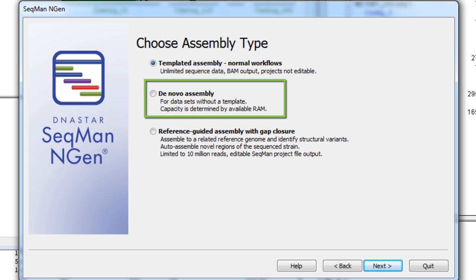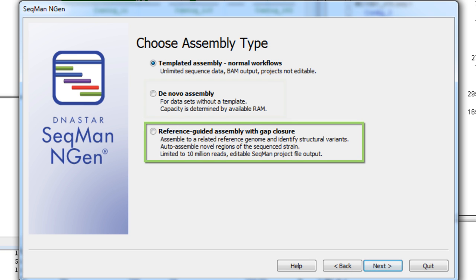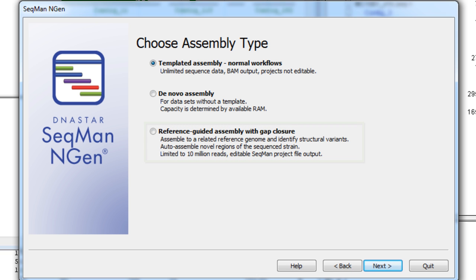If you want to merge contigs in either a de novo assembly or a reference-guided assembly with gap closure, you can easily do so in SeekMan Pro to reduce the number of gaps in your assembly.